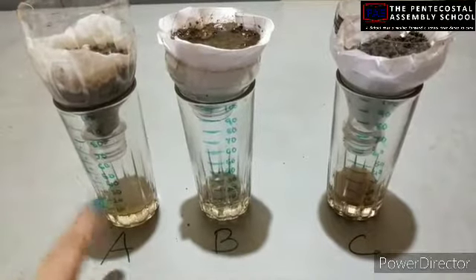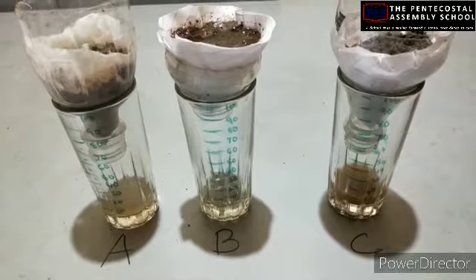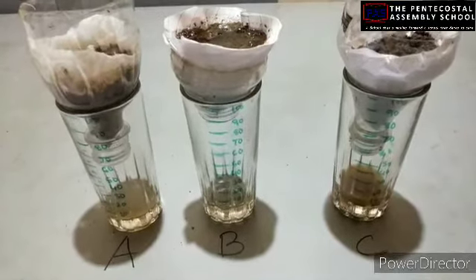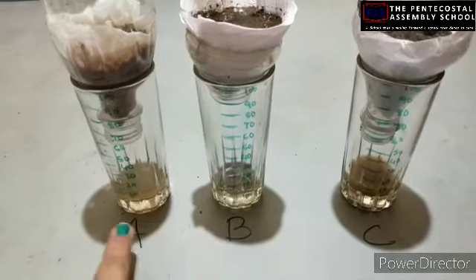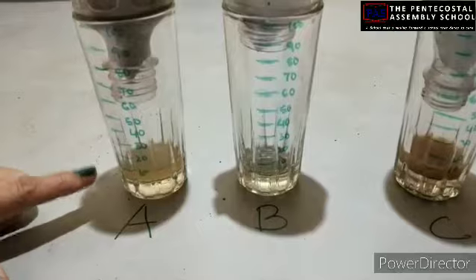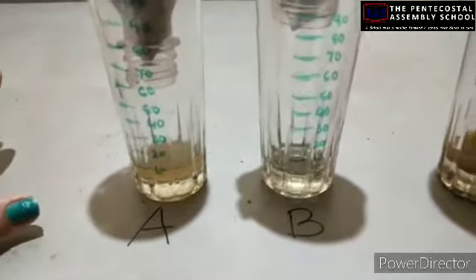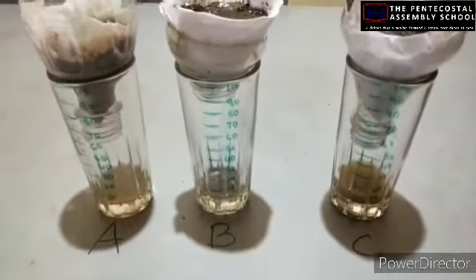Here you can see water is percolating through that, and the percolation rate we have to find out. Now the rate of percolation in all the 3 samples, you can see, is different. We have to wait for a few minutes so that we can check the rate of percolation.